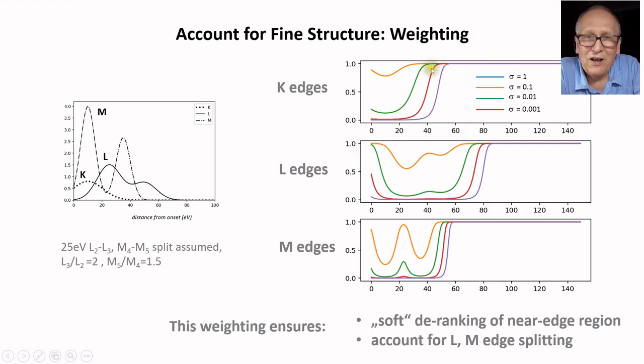But if we have a lot of noise in the spectrum, our fit is anyway not good, and in this situation it's too expensive to exclude a very large region from the fit. Yeah, but actually, as you see from these numbers, the dependence on noise is not very strong. It rather depends on the order of magnitude of noise.